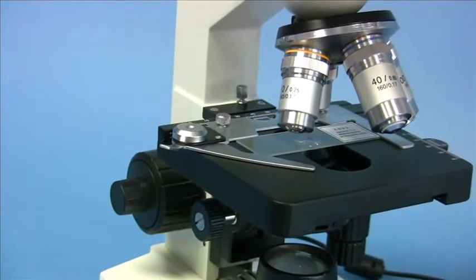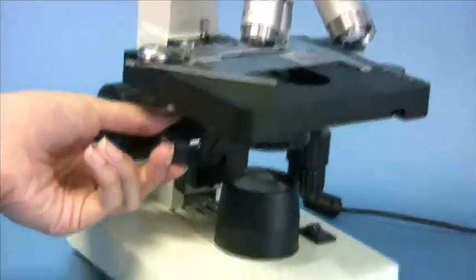At the bottom, this microscope has a movable condenser.